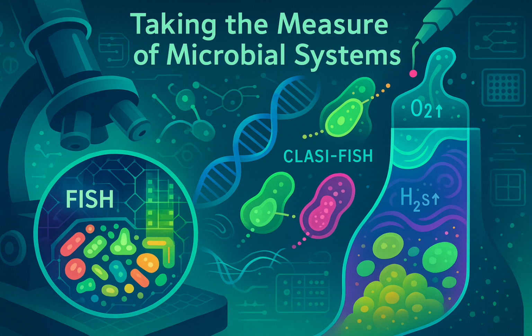The next big question is always, okay, but what are they doing? Can you see activity with these methods too? Yeah, can you actually visualize their metabolism somehow? You can. Specialized techniques combine the identification power of FISH with ways to measure metabolic activity, again at the single cell level. Things like CARD-FISH and BONCAT-FISH are really powerful here.